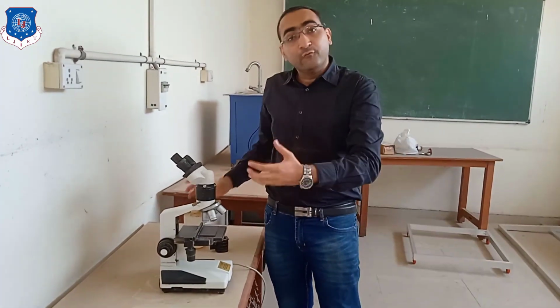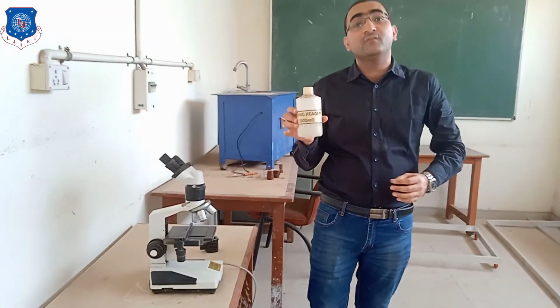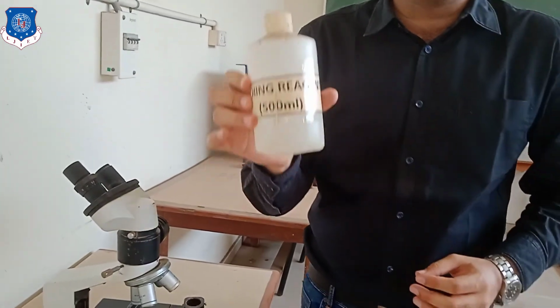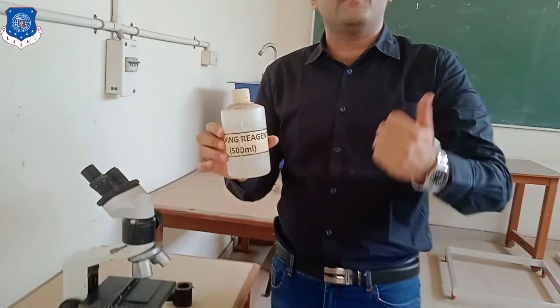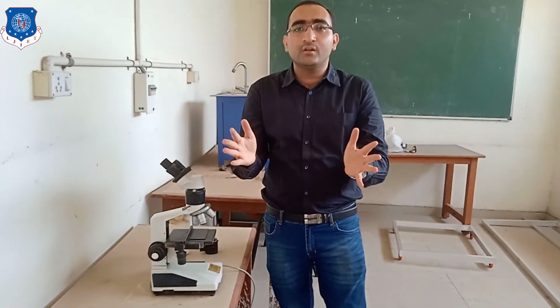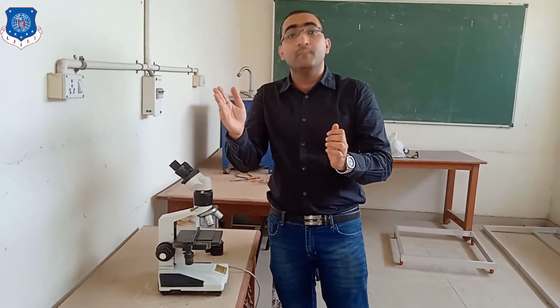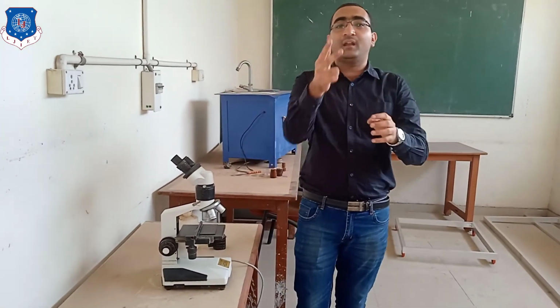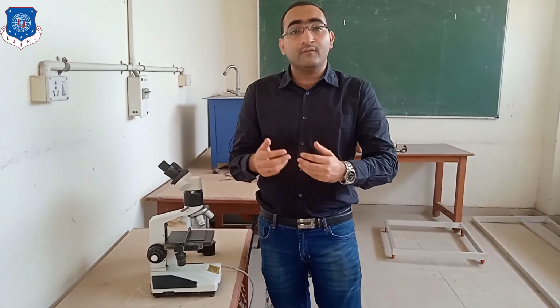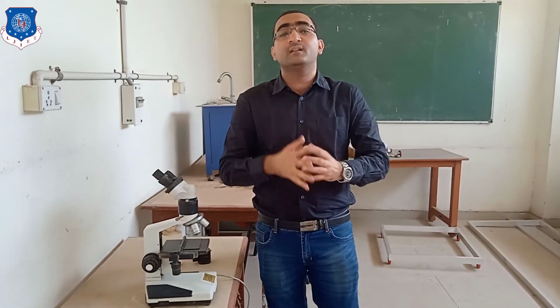Before placing your sample inside this microscope, an etchant is always required. Why do we go for this etchant? This etchant is used to make one surface corroded and the other bright. So there is a light distribution which we will see, where one surface will be darker and the other brighter, so that we can distinguish between the two. This is also used to find out the percentage of each phase present in the material.